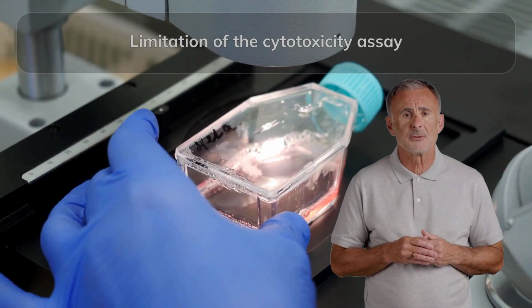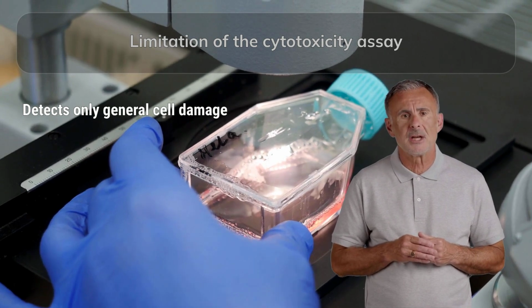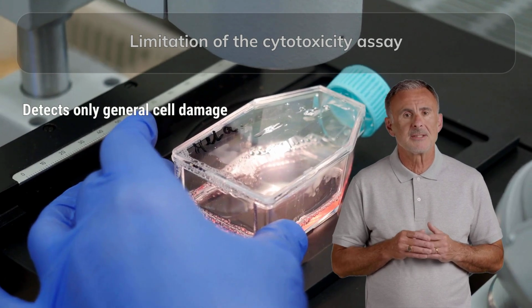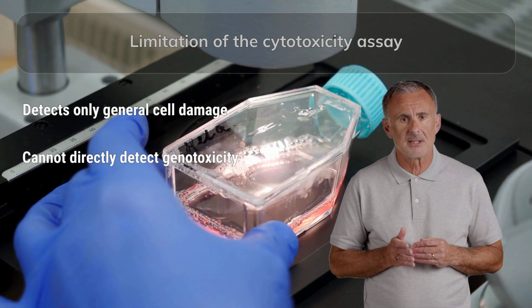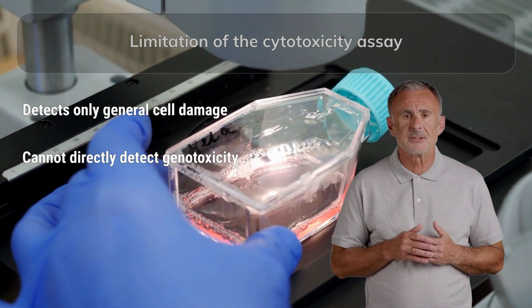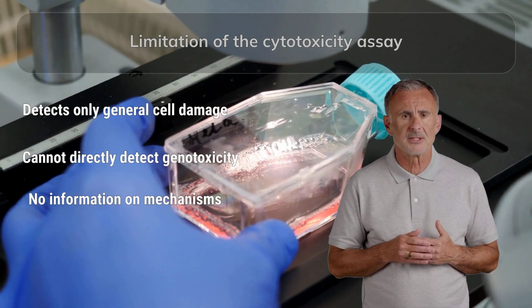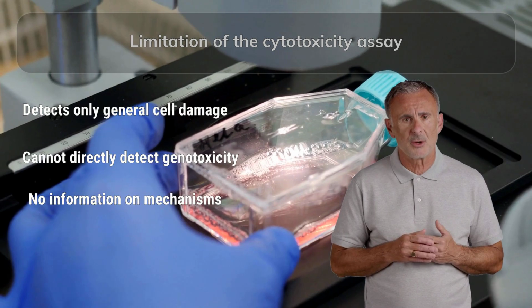Now, let's see some major limitations of the cytotoxicity test first. It detects only general cell damage. Cytotoxicity tests measure loss of cell viability, membrane integrity, or metabolic activity. They can indicate if a material is harmful to cells overall, but not the specific type of harm. Cannot directly detect genotoxicity. Some substances cause DNA damage at doses that do not cause immediate cell death. No or limited information on mechanism. A positive cytotoxicity result doesn't reveal whether the damage is due to membrane rupture, oxidative stress, metabolic inhibition, or DNA injury.